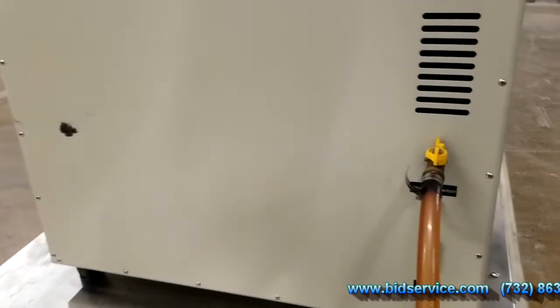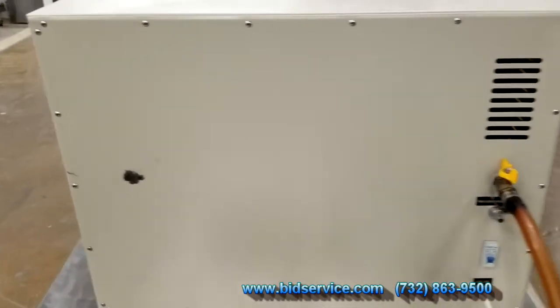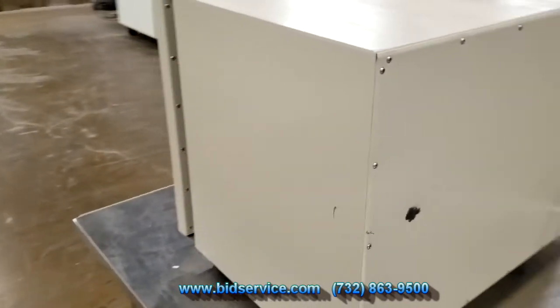You do have to hook up a vacuum to this — it does not come with a vacuum. Here's the other side.